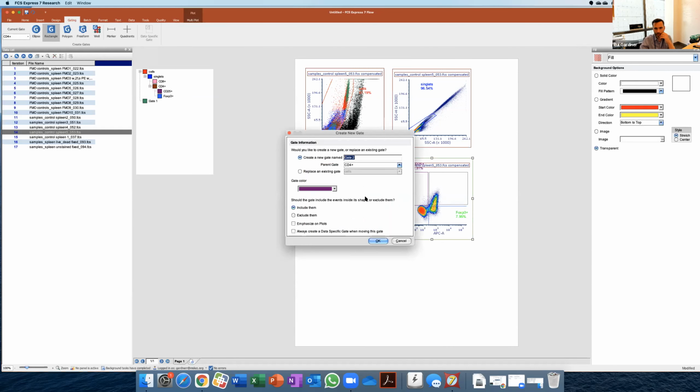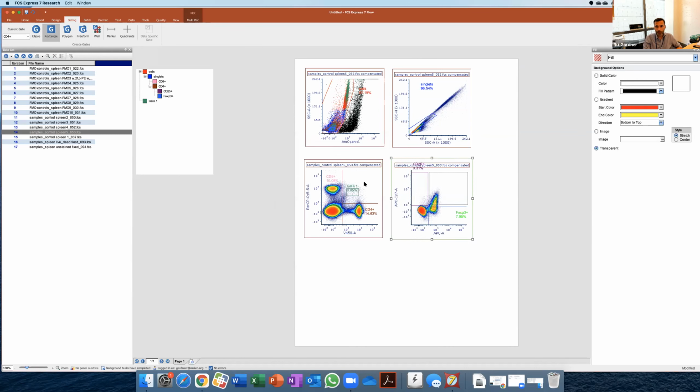these would be, let's say, the double positive, right? So I'll just put CD25 positive, FOXP3 positive. All we can say really is that we have, and I'll join these gates to make sure that we're getting all of them, all I can say is that we have at least 8.4% double positives, but I can't say that we have exactly 8.4% positive, right?